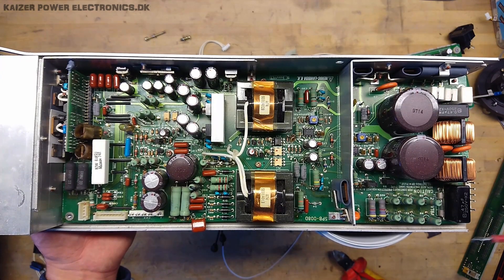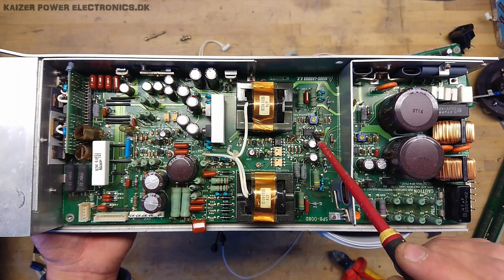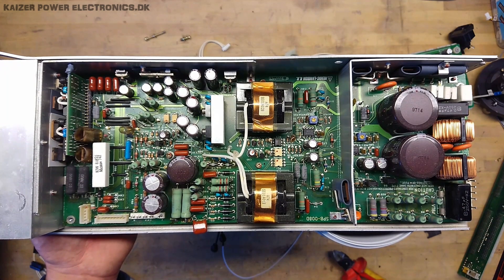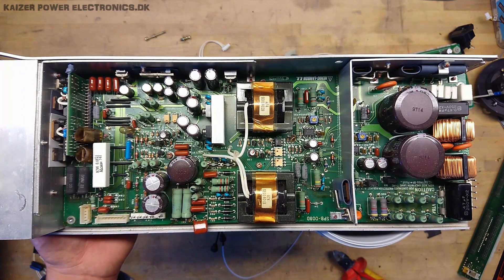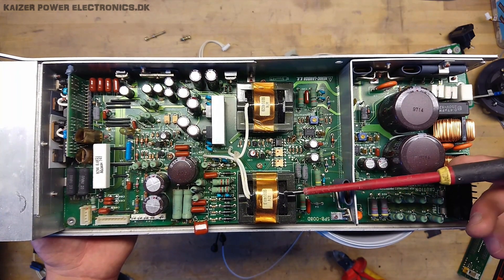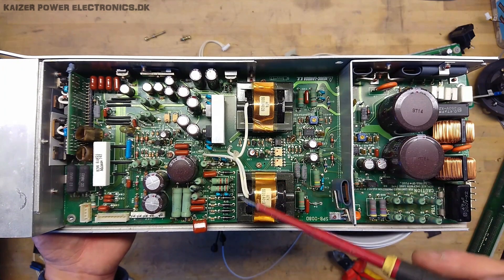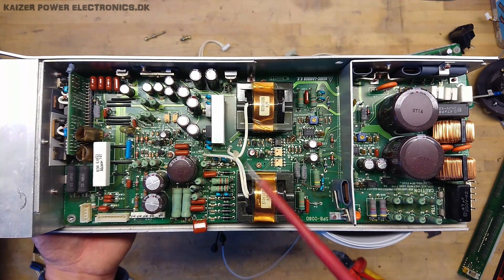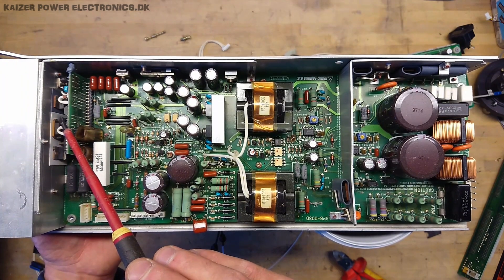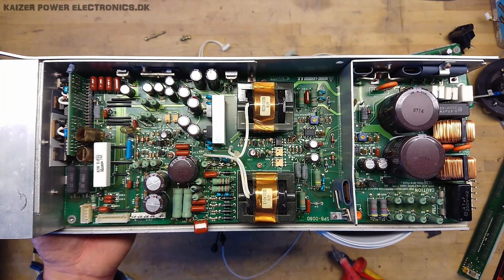Internally the power supply is fairly standard: input filter, bridge rectifier, DC bus bulk capacitance, and small power supply controllers. There are six different output channels. We have what is probably a PFC chopper at the input stage, then what appears to be a center-tapped output from two transformers — not entirely sure of the configuration. There are regulation stages and possibly a standalone control board, making up almost six individual power supplies within this unit.